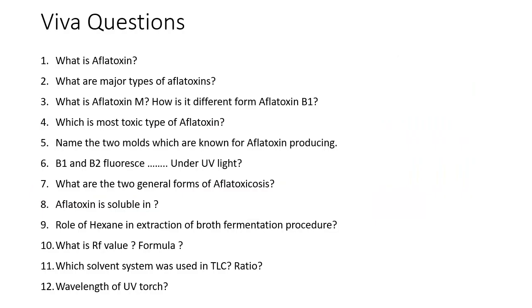So now let's move towards Viva questions. We have done isolation of the aflatoxin producing organism, and we have also studied the extraction and detection of aflatoxin. Depending on all these three topics, these are some Viva questions that I could think of. And yes, the examiner can ask you anything depending on your answer, and he can link another question, but still you should be prepared for at least these basic questions.